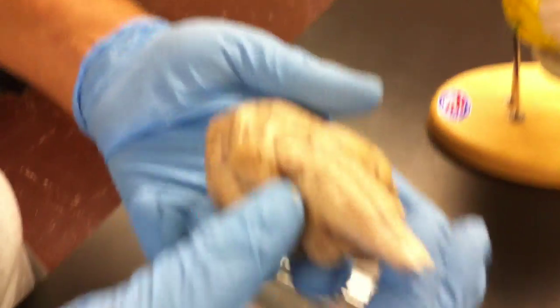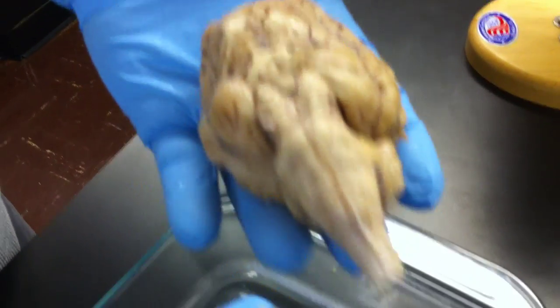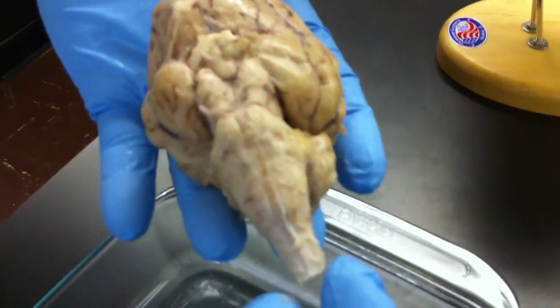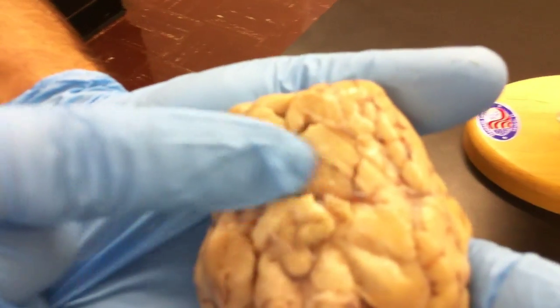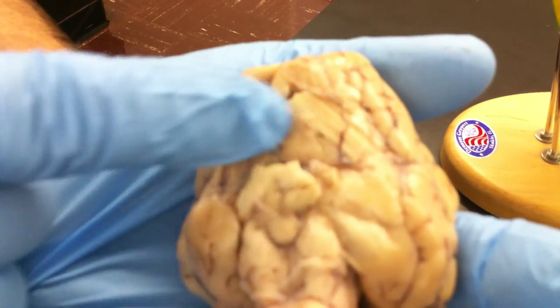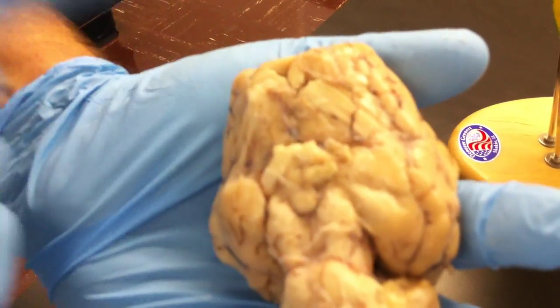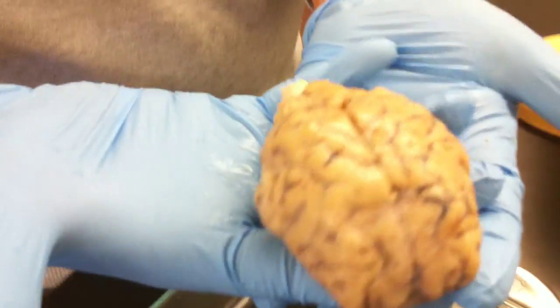Then if we turn the brain over, you can see some of the brainstem structure down here. A lot of the nerves from the brain enter the body, come off from this part. And then the only other structure I think that you can really take a look at is this light band of tissue right here. That's going to head off into the eyes, and this is in fact the optic nerve, with large bands of neurons heading toward the eyes. Okay, so that's about it on the overall structure of the sheep brain.